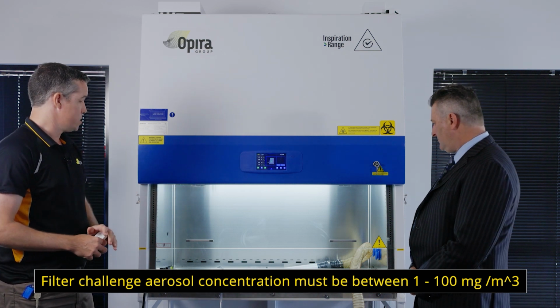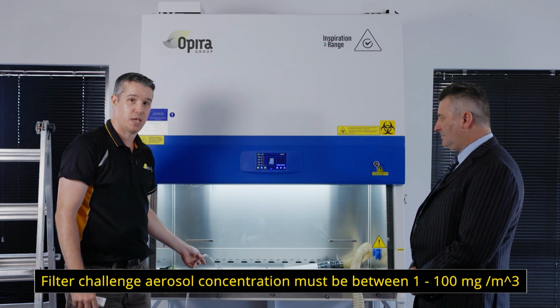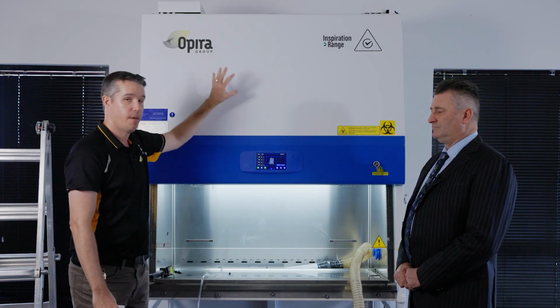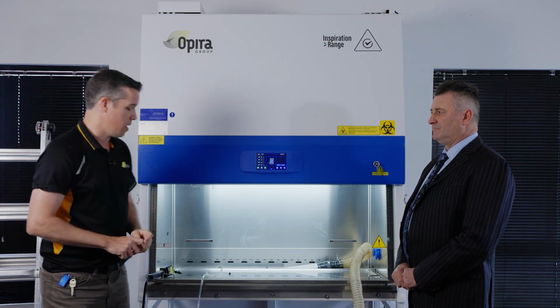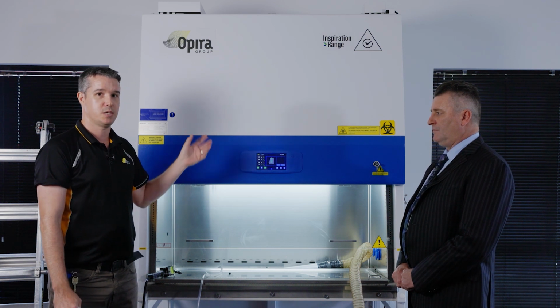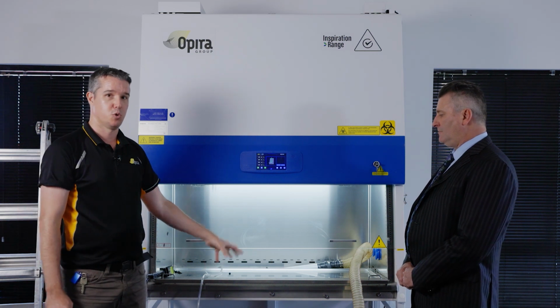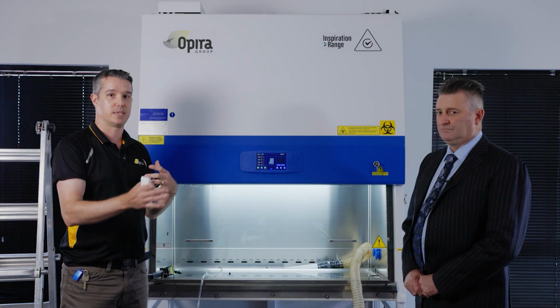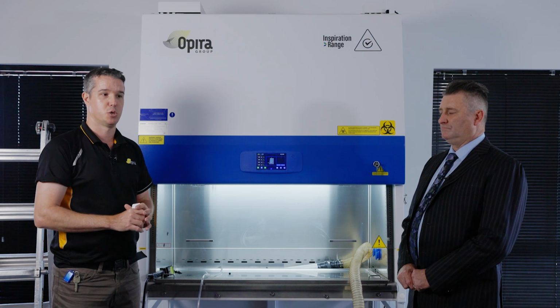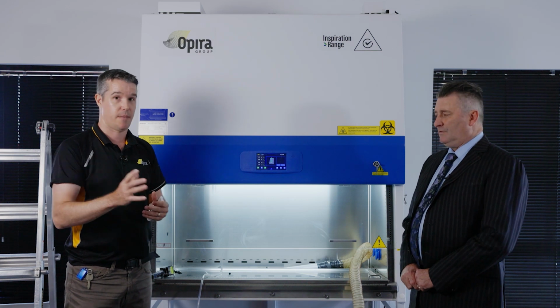The aerosol generator hose is set up to release aerosol into the cabinet, and we've got our photometer connected to an upstream sampling point to measure that. That upstream sampling point is from one of the plenums, in this case the laminar flow HEPA filter plenum. Once I turn the aerosol generator on, I will record the absolute concentration in milligrams per cubic meter, again within the required range, and then I'll calibrate the photometer to recognize that as the 100% challenge concentration. Then I'll change the range setting of the photometer down to accurately read what 0.01% of that aerosol is to test the HEPA filter.